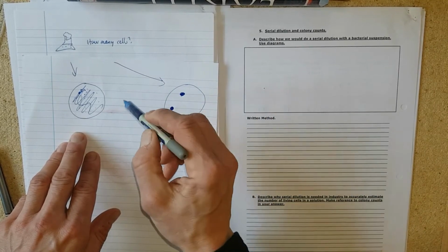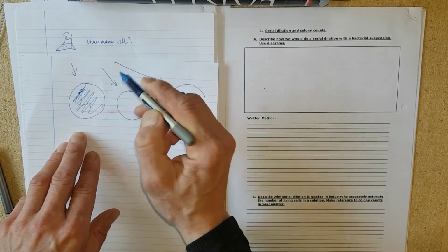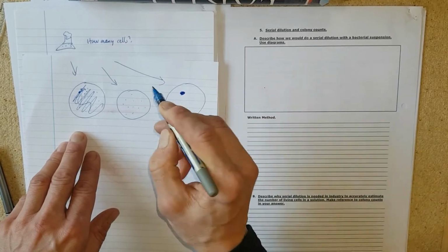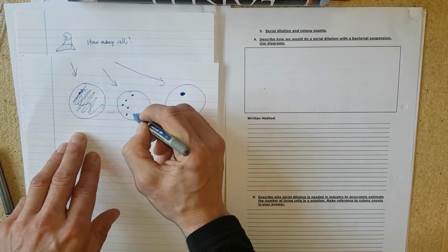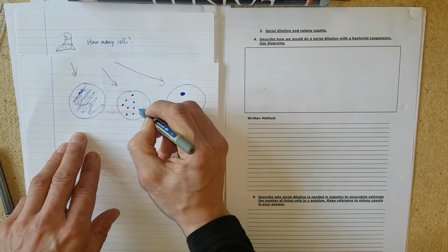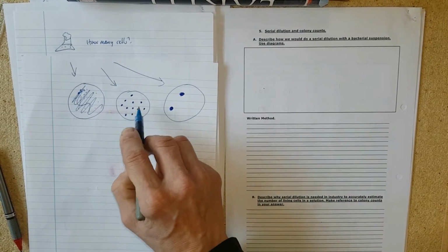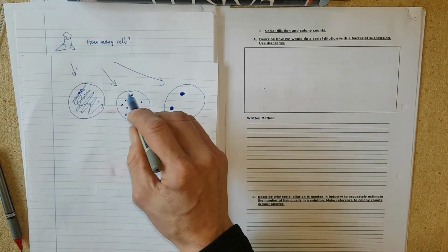So what we want really is a count that gives just a few colonies, so there's enough to count reliably and you can still see them as separate colonies.